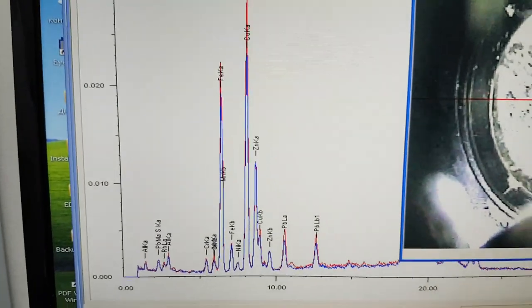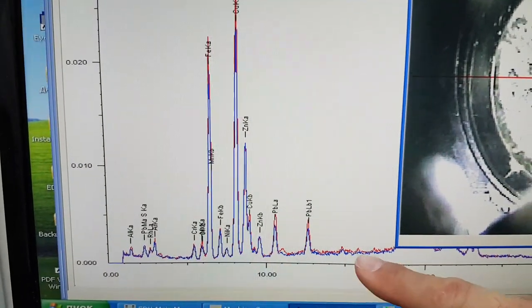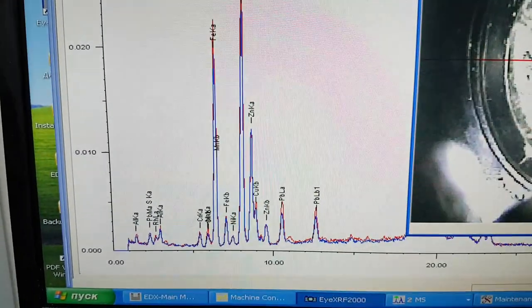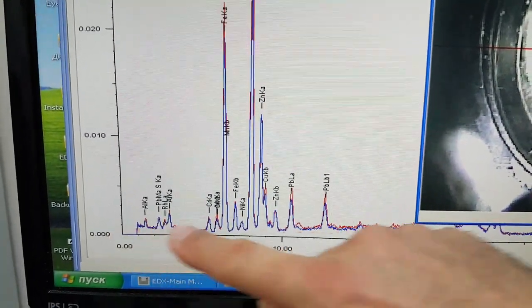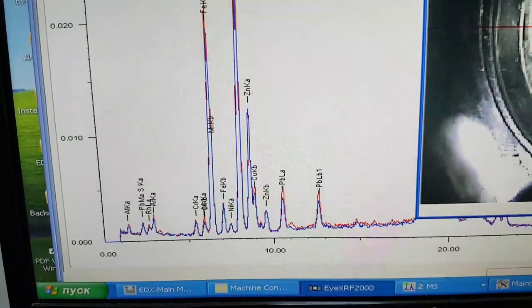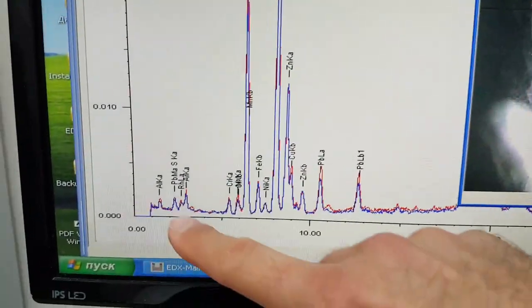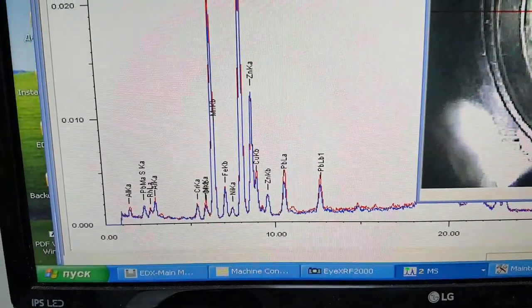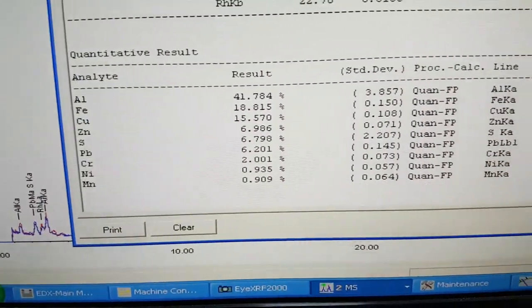Lo and behold, it's a pretty close match. There's a little bit more copper in the second sample. The iron and copper ratio is switched around, but pretty much every peak is spot on. You'll note that the aluminum is very low by comparison. I think we've got a table of the previous one here.